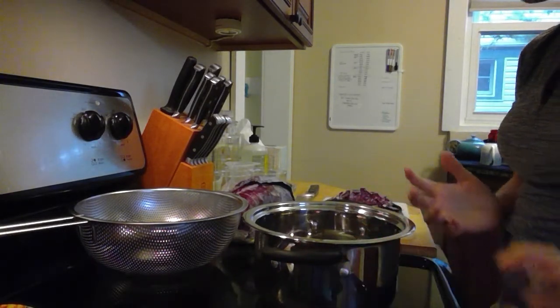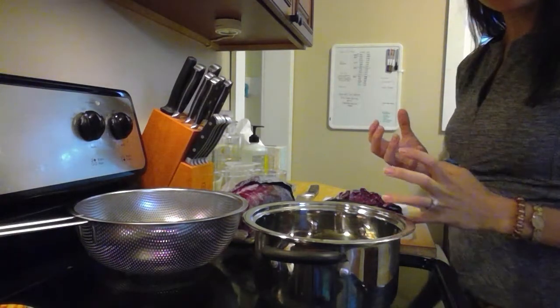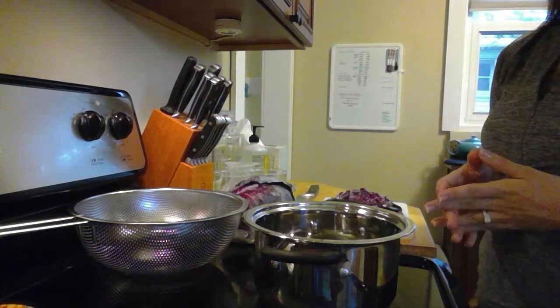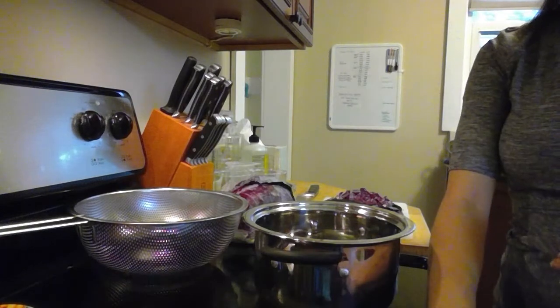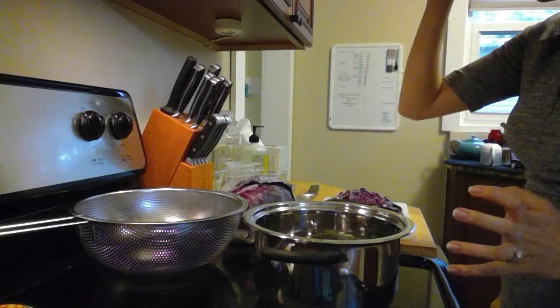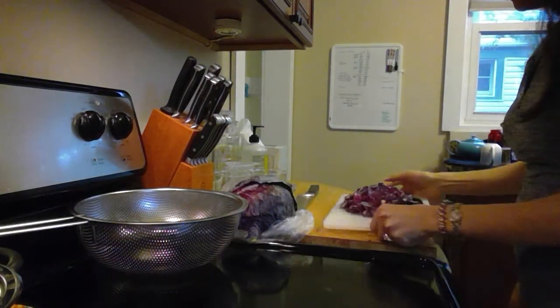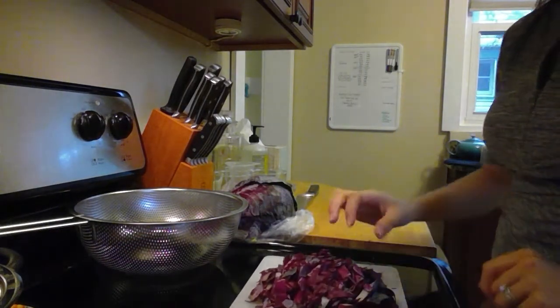Now you'll also need all of your other testing items. So you want to go through and make sure that you have 12 different items ready to go to test and some labels for them as well. Now, first things first, your lab says that you're going to actually cut up your cabbage into about 1 centimeter strips.